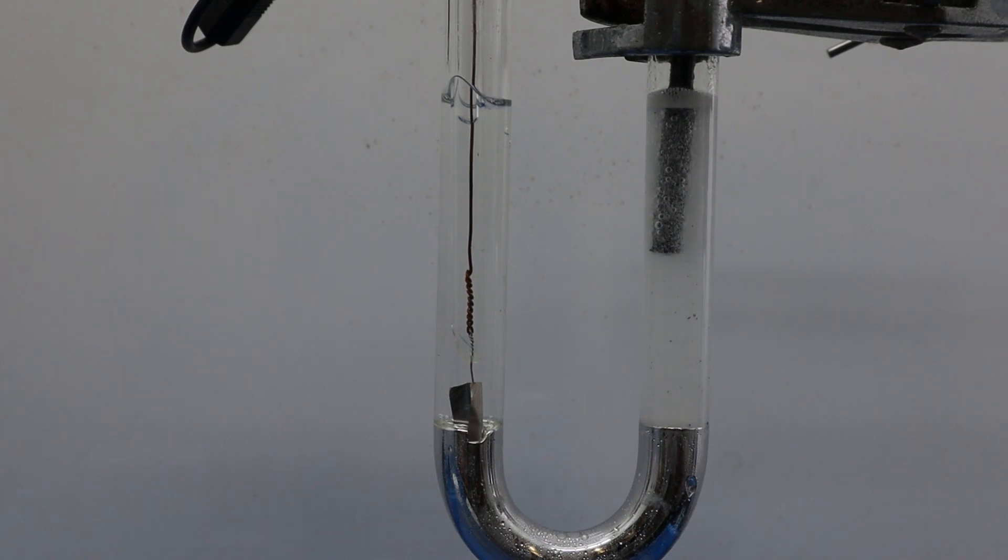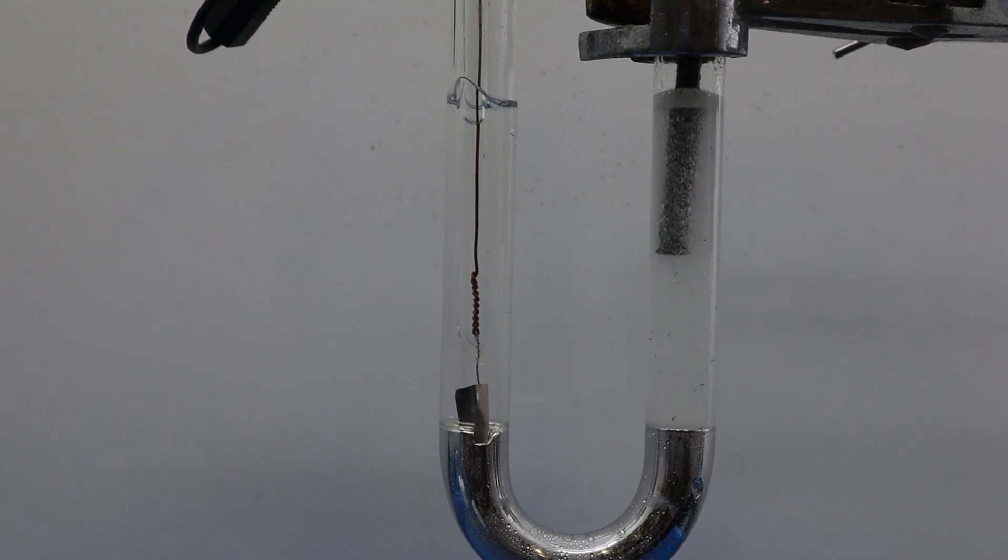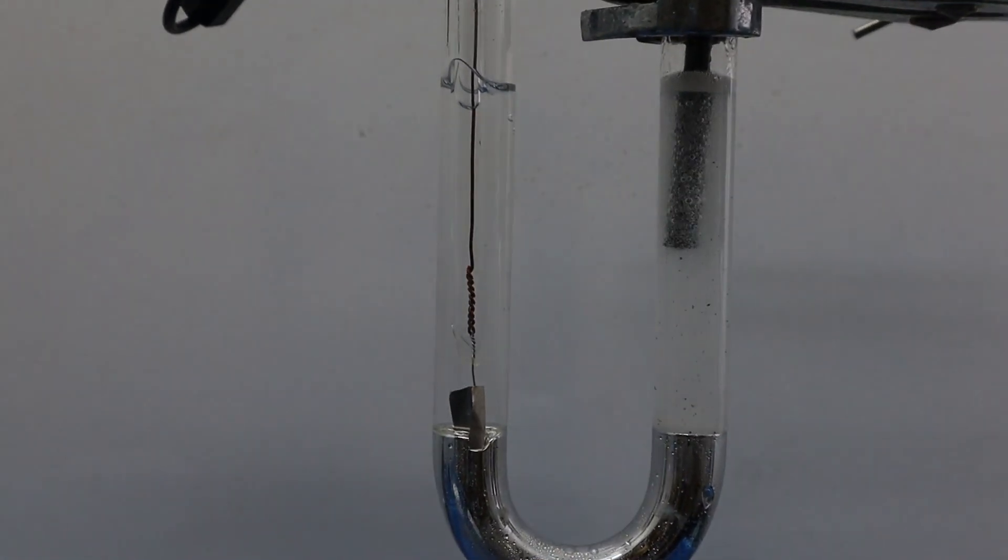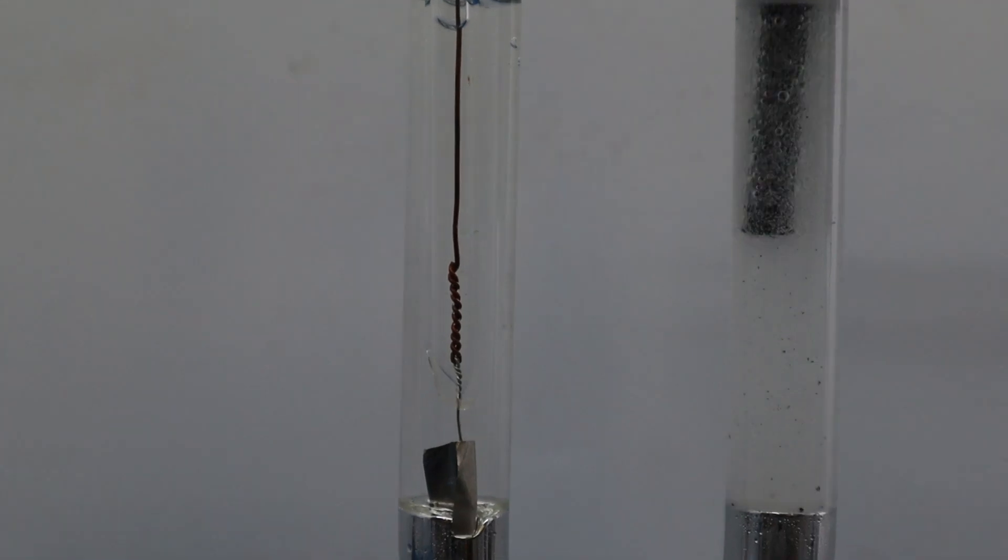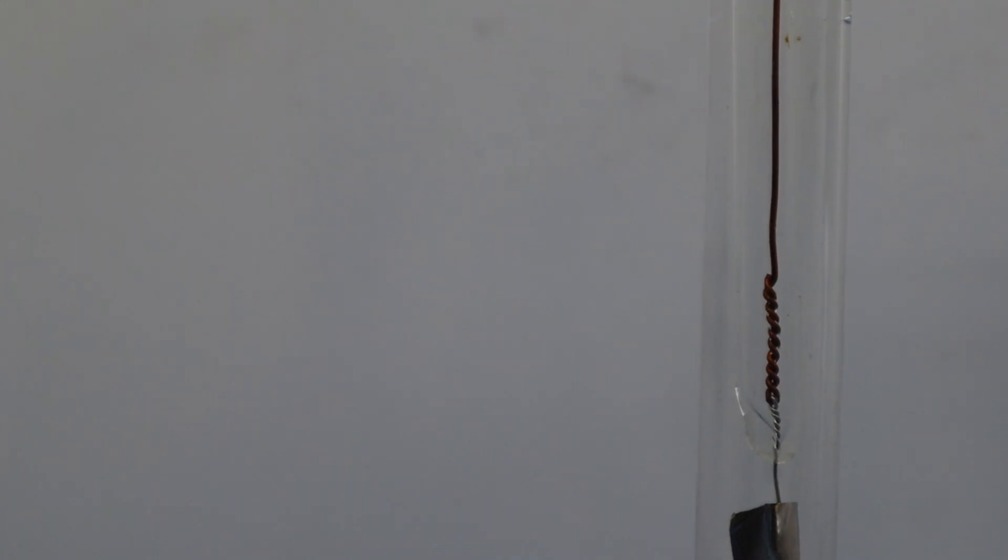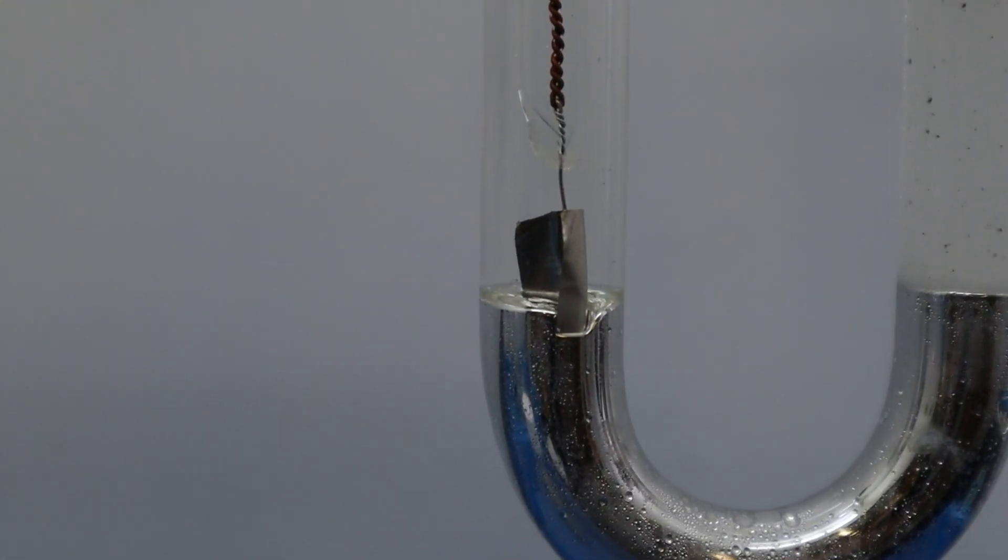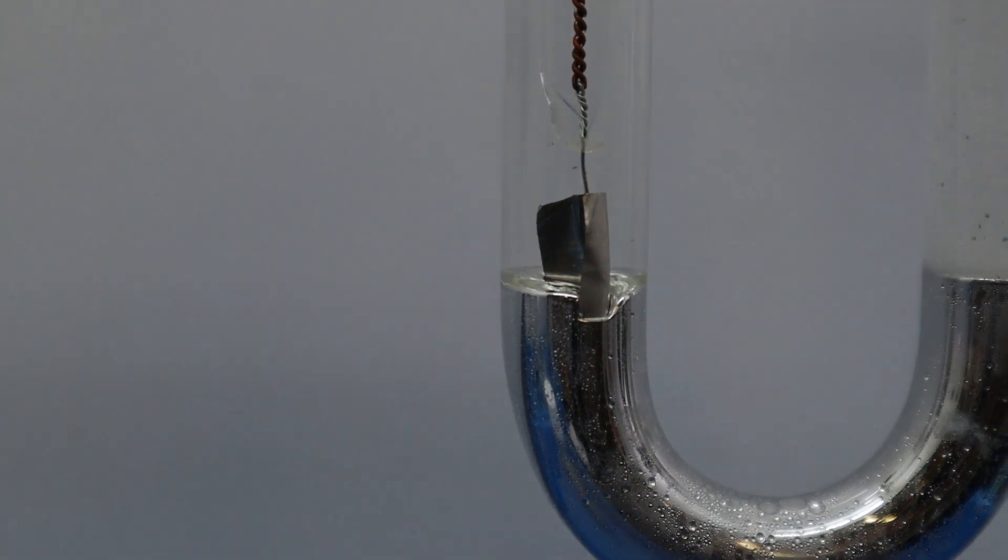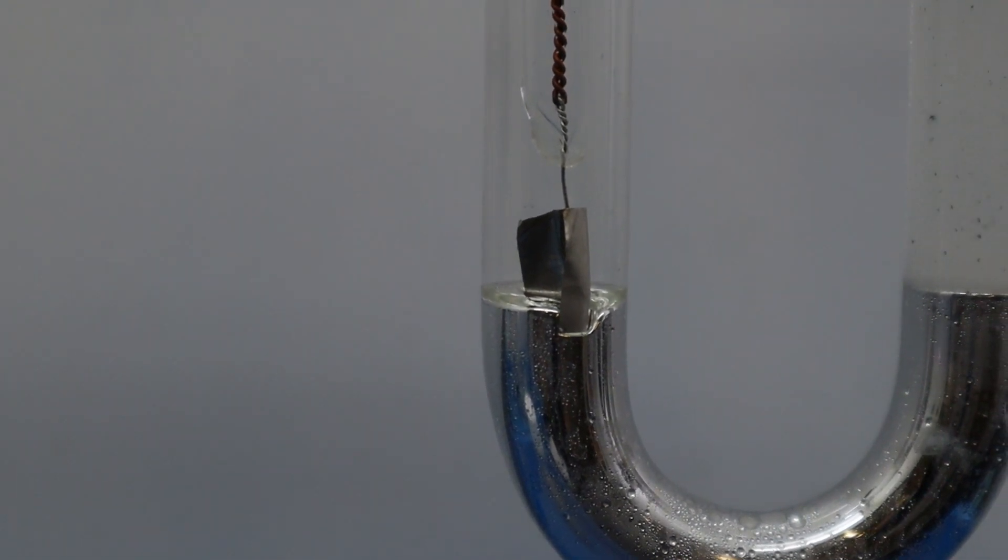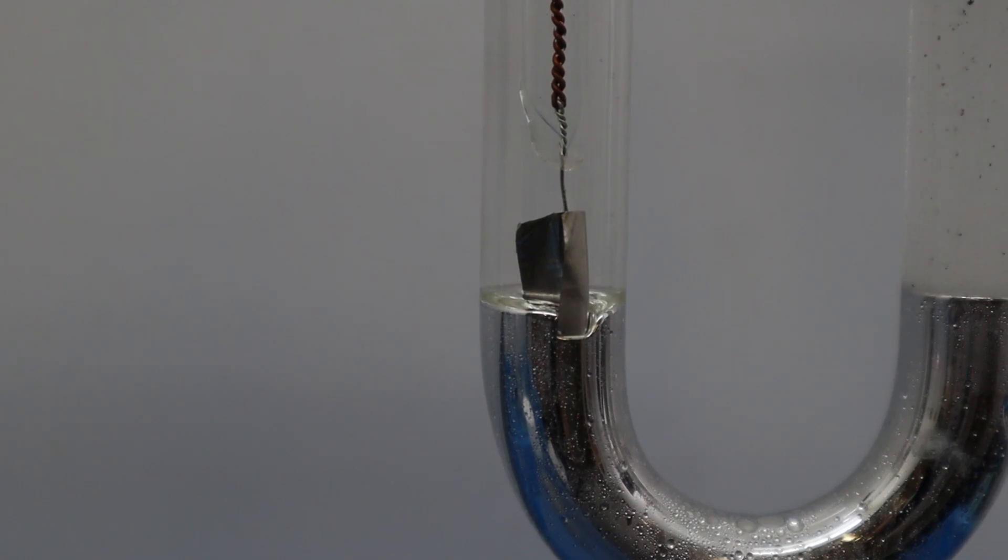As you know, sodium ions are discharged at the cathode and form sodium amalgam. When sodium contacts with the deionized water, it is expected that sodium reacts with water to form sodium hydroxide and hydrogen gas. In the past, I expected that the hydrogen gas bubbles will rise from the surface of mercury to the water. However, no such results occurred.